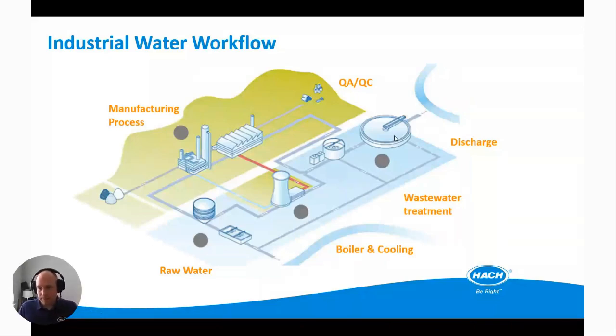Excuse me. So I just want to spend a second thinking about what might be in this water. Coming into your plant, there's whatever's in your water, coming from your source, whether that's a city water supply, so it's chlorinated, or it could be a river, so it has various minerals. And then as it passes through these various points in the industrial flow, what could be getting in there? Is there a product in this water? Are there treatment chemicals? Is there oil and grease, waste, analytical reagents coming from the labs? All of that stuff will join together into one stream as it's discharged.